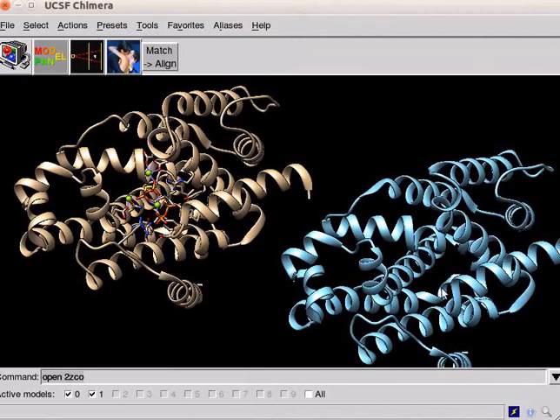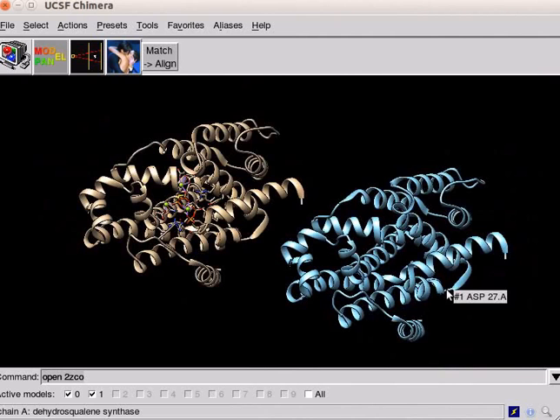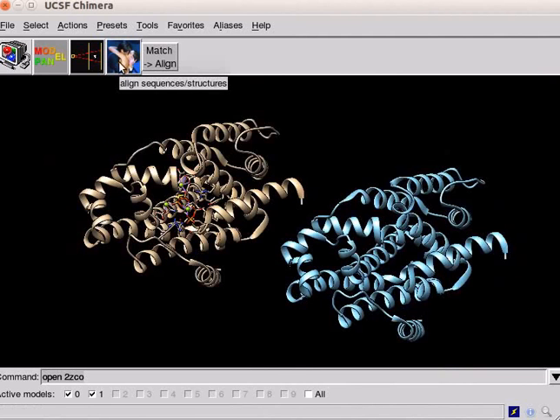The structures are now in different positions. Now, let us superimpose the structures using matchmaker function. Click on matchmaker tool on the toolbar.